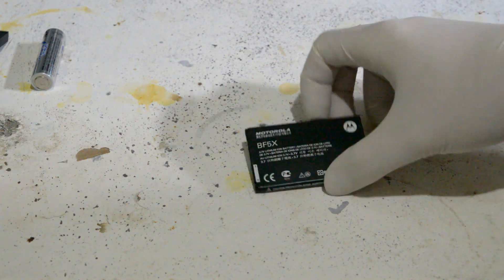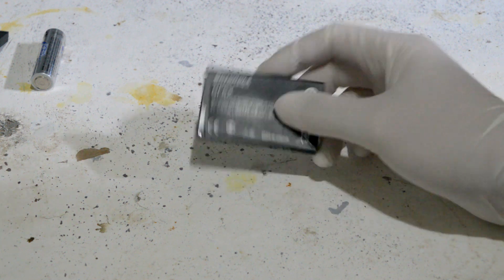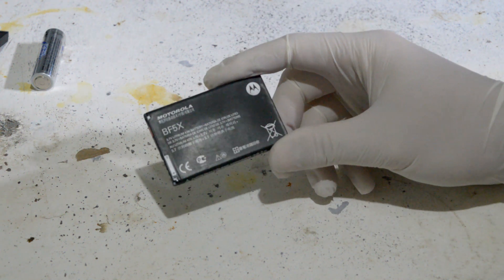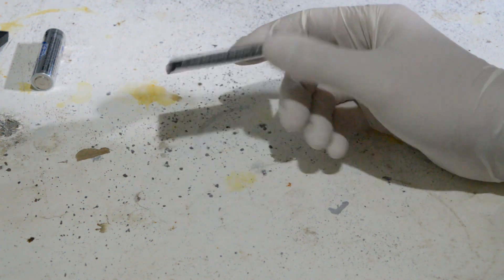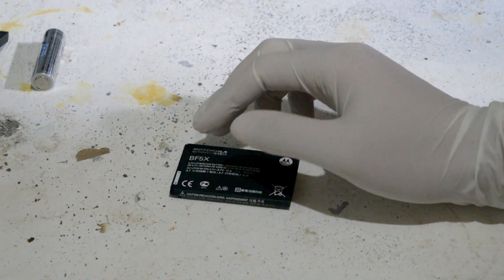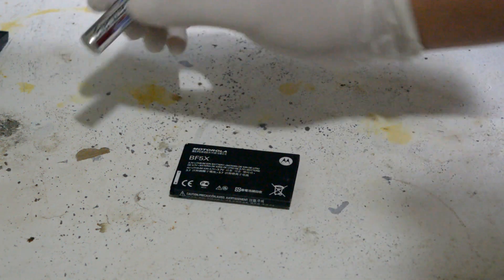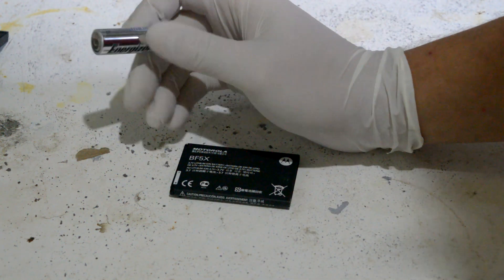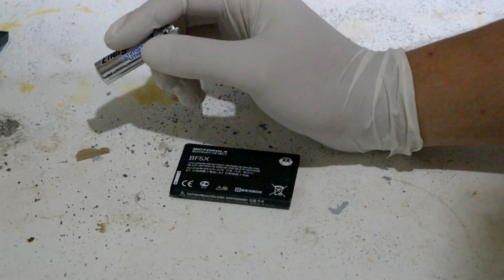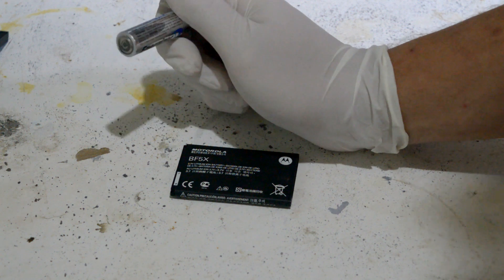Hello and welcome back to a new Extractions and Fire project. What we're going to do is try and get lithium from batteries. If you search lithium from batteries on YouTube, there's a very common video about getting lithium from these types of batteries, because these batteries happen to contain pure lithium metal rolled up inside. It's quite a reasonable amount too.